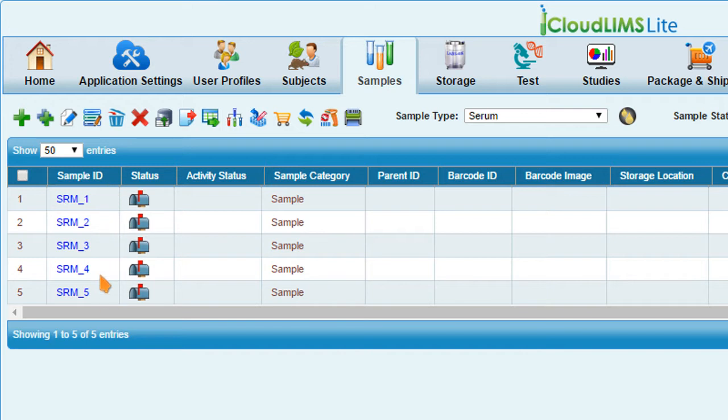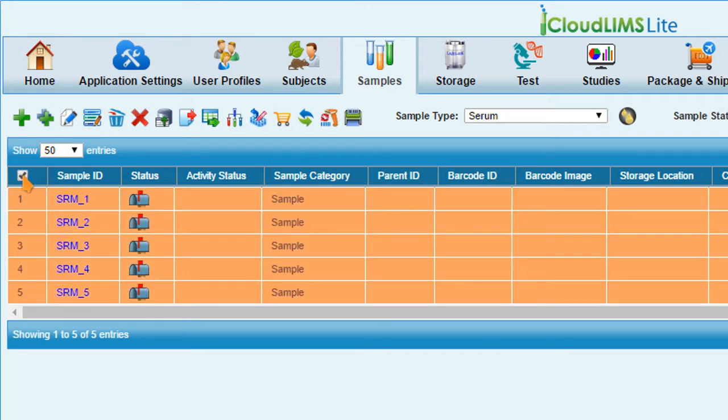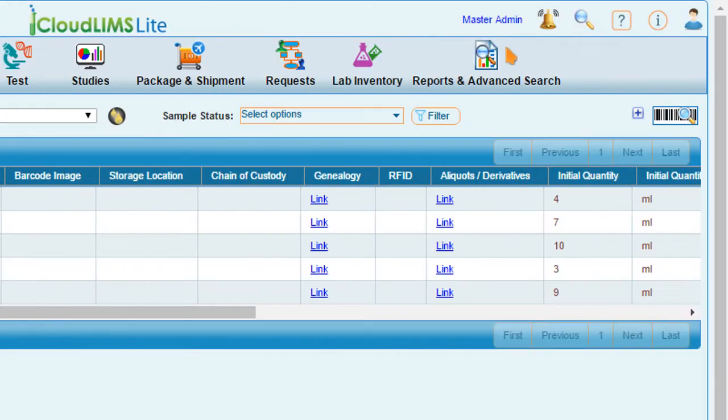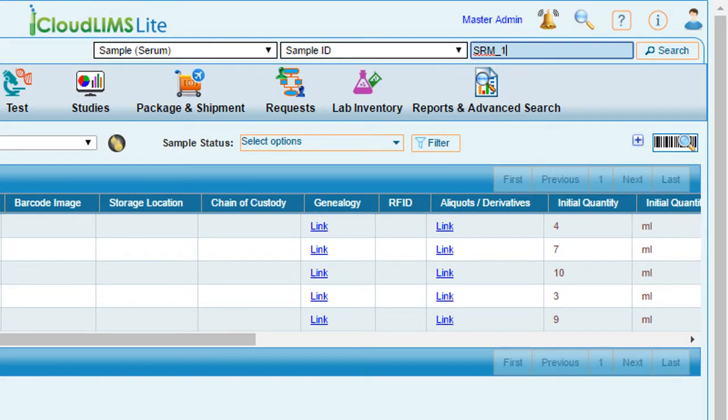If you would like to change the value of a particular attribute or attributes for multiple samples, use the Batch Edit feature. Select the samples to be edited in the sample module or search using the Contact Search button here.